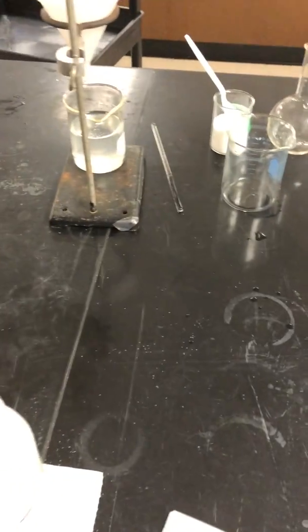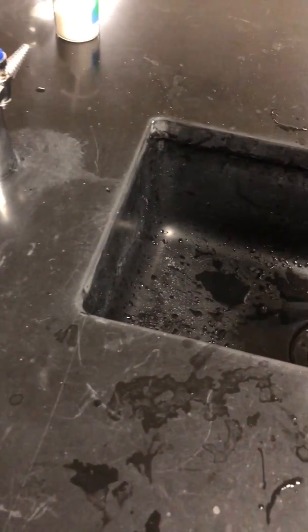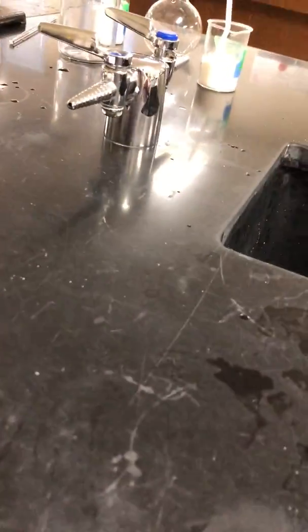Get a nice close up of my papers there. Station 4. It looks very similar to Station 3. And there's a reason. All right, we're going to do the same thing. Let's measure approximately 150 milliliters of water. Nice. I guess you guys can tell that I really like this stuff.